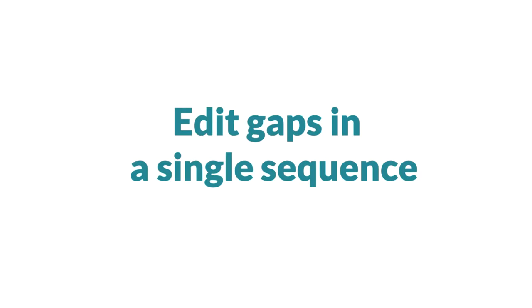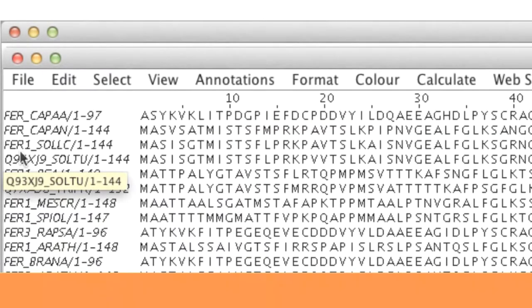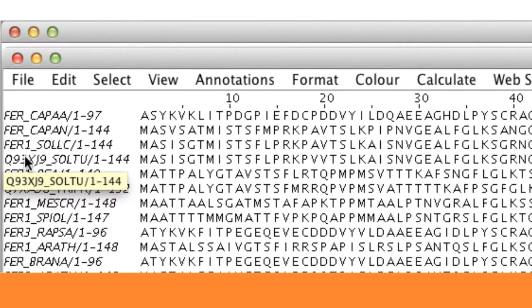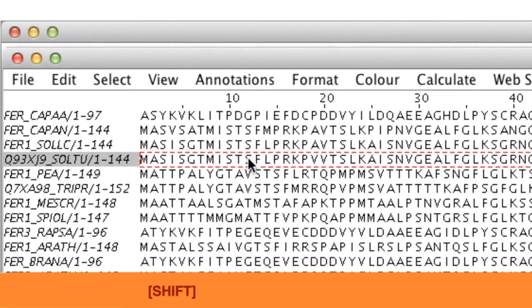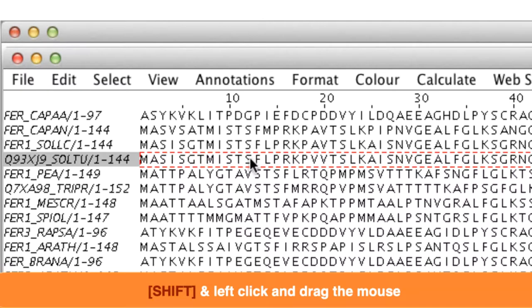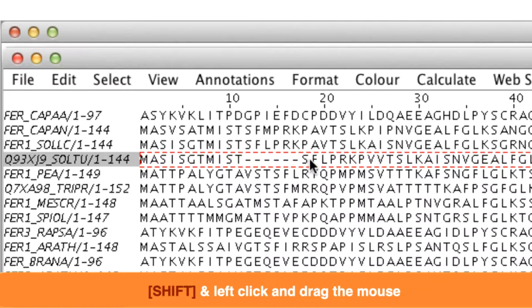Gaps can be added into sequences. To insert gaps into a single sequence, I select the sequence of interest in the Sequence ID panel using the left mouse button. I hold down the shift key and place the cursor on the residue where I want the gap to appear. I click the left mouse button and then drag the sequence to the right until the required number of gaps have been inserted.